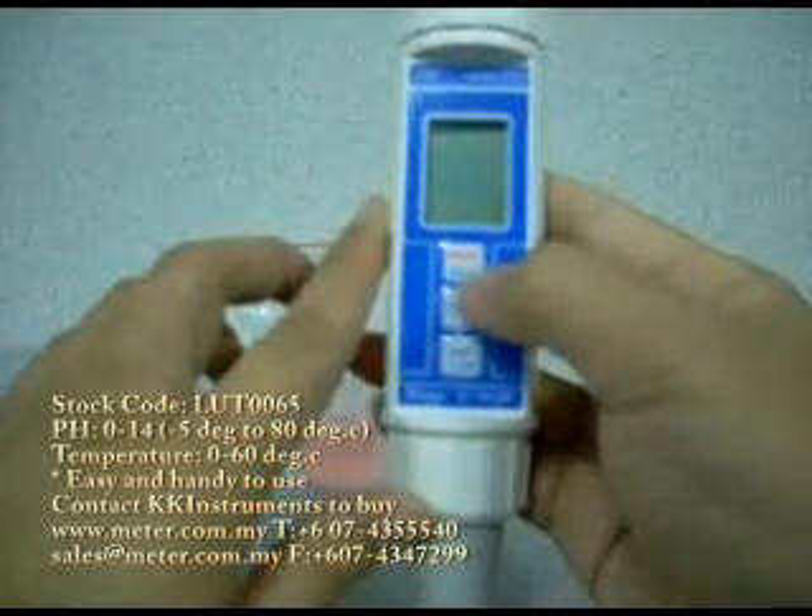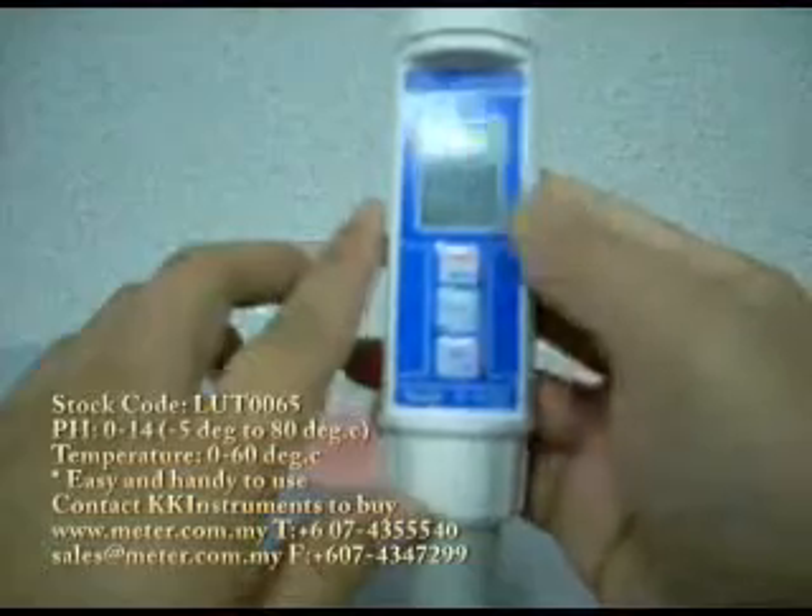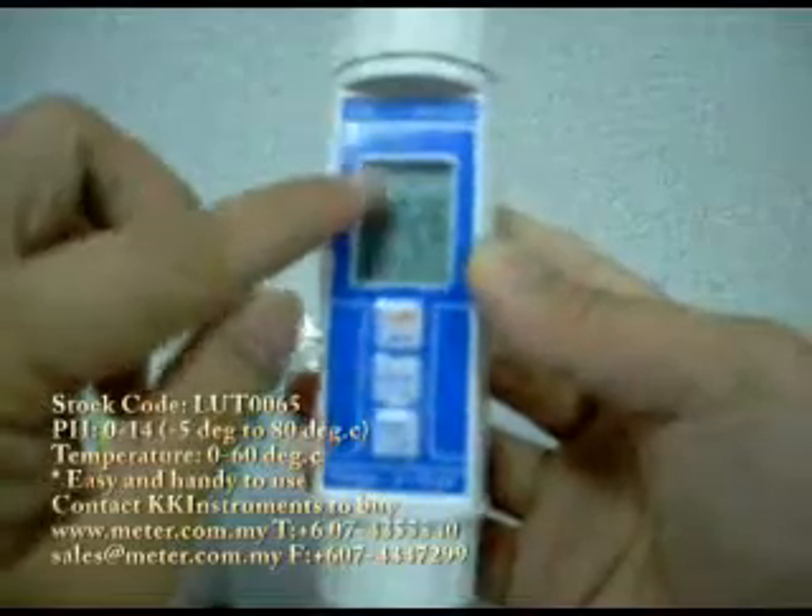You press one more time and it is going to switch it off. There is a bar here to show you the level of the pH presence in the solution. It is from 0 to 14.